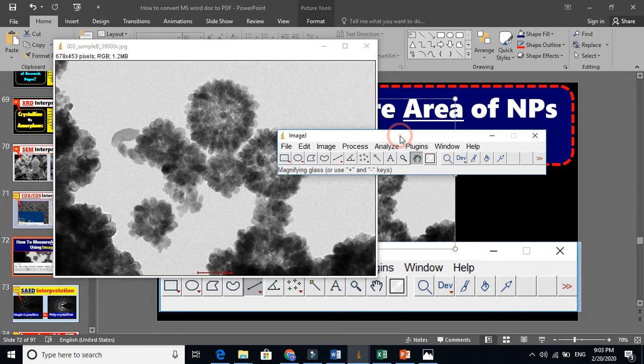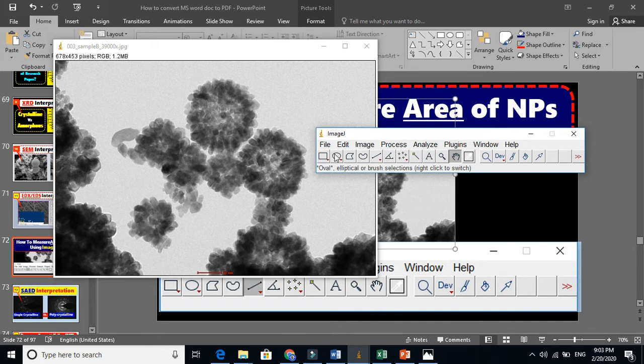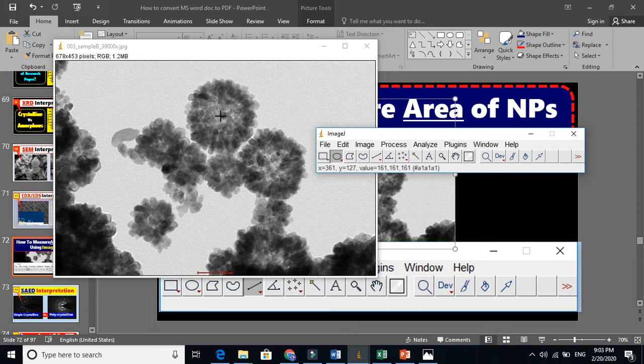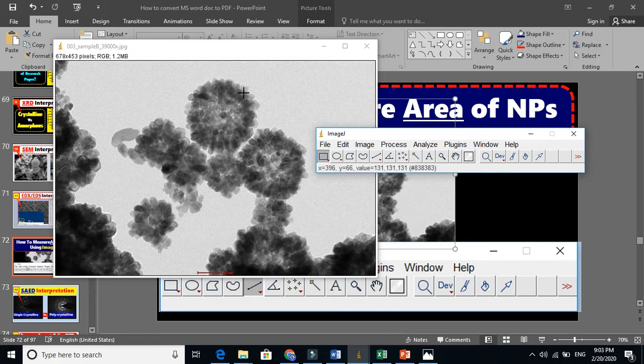Now, if our nanoparticle was a completely circular shape, we can simply use this circle tool. If we have a rectangle shape, you can use the rectangle tool. For this particular zigzag shape, we have this freehand selection tool.